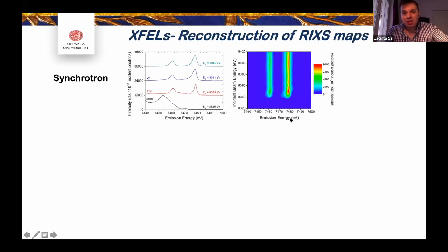So it became kind of clear that it's going to be tricky to do RIXS. The other thing is that at the moment, most of the experiments, or until quite recently, done at the free electron laser, you needed monochromated pulses. And that also, of course, means that you will have a drop in the flux of the pulse itself, but most importantly, you have a huge temporal broadening of the pulse. So if you start with about 1 femtosecond, you will end up with about 20, 30 femtoseconds. And if you go back to the time scale that we need to look at for the plasmonics, the process starts basically through Landau damping within a few femtoseconds. So we want to use the shortest, most intense pulses possible.